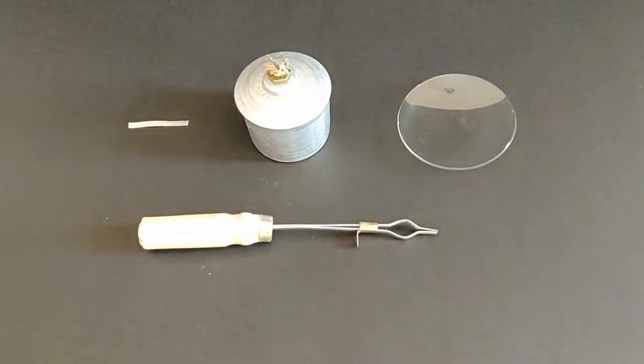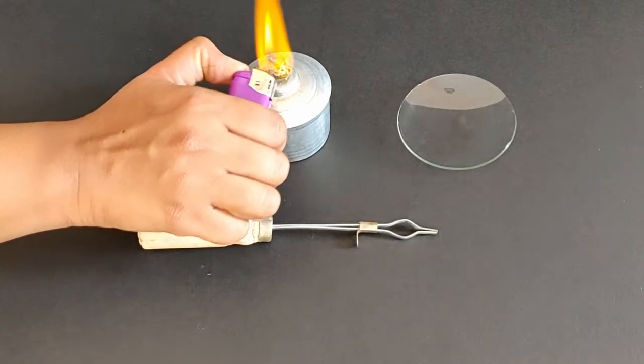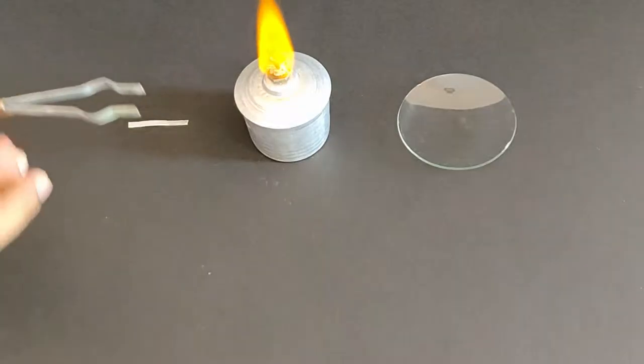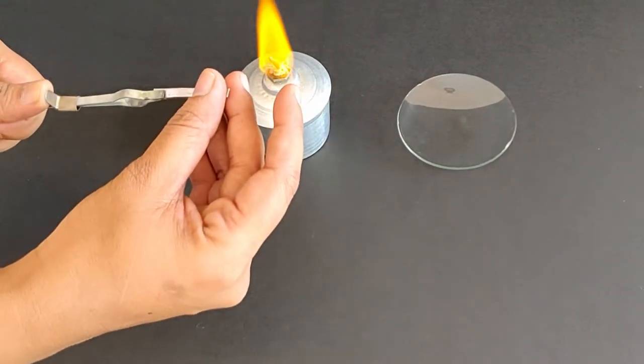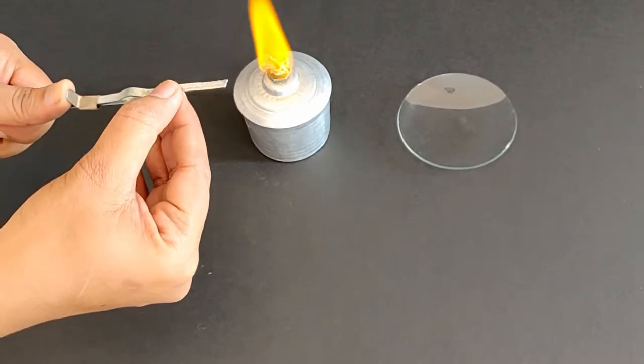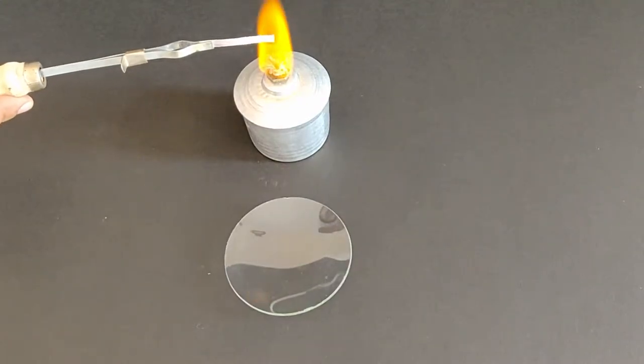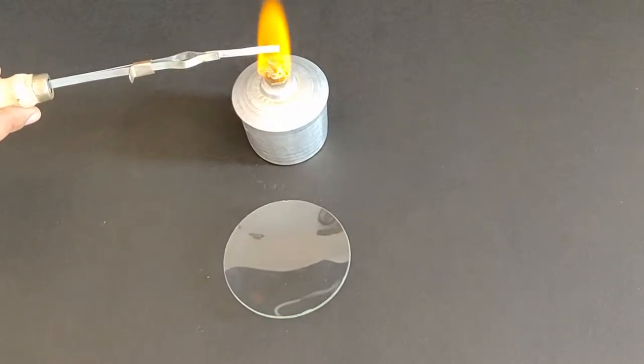Light the spirit lamp using a lighter or a matchstick. Secure the magnesium ribbon or strip to a test tube holder. Hold the ribbon over the flame till it catches fire.